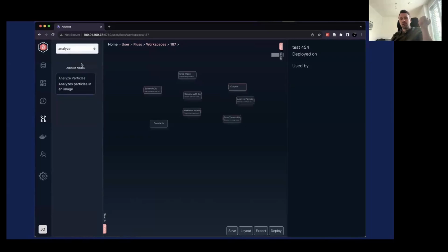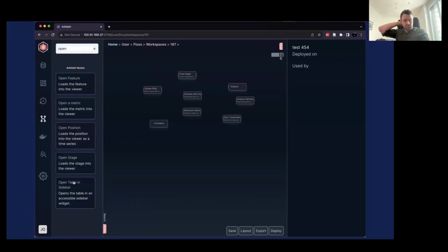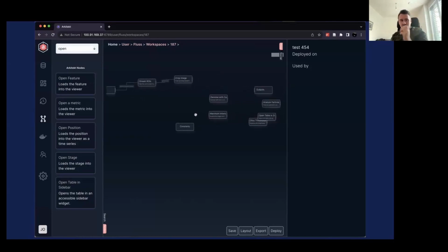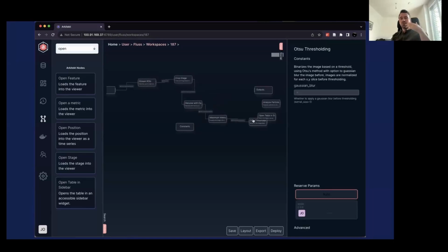So she searches for that functionality, and now she has all of these nodes in the workflow pane. And now to orchestrate this task, she just has to connect them, creating this data pipeline. Let's see just how this happens. Like you say, the image that goes out will now be denoised, then it will be maximum intensity projected, then it also needs to be thresholded, and then use the analyze particle plugin.